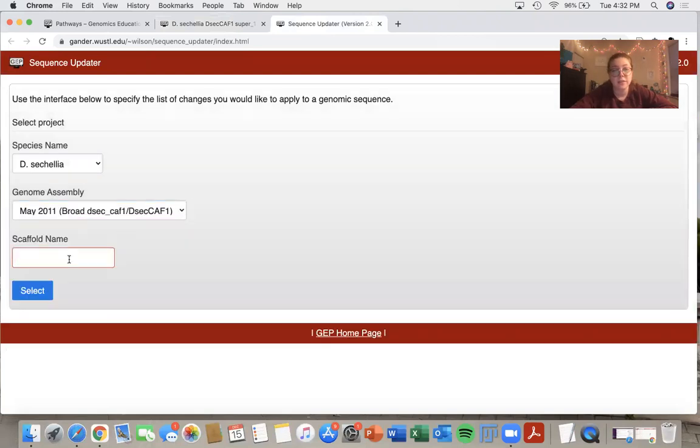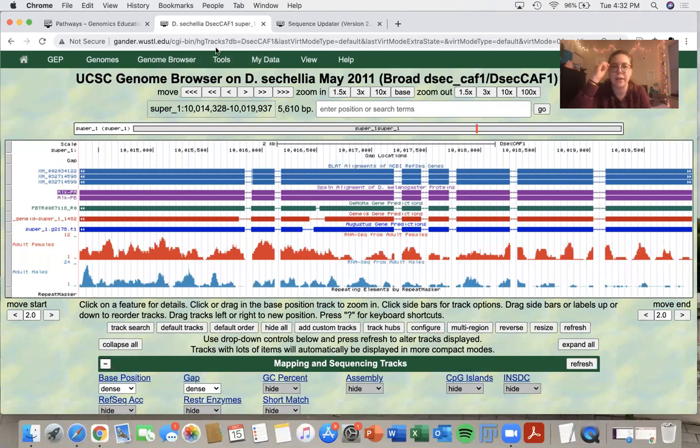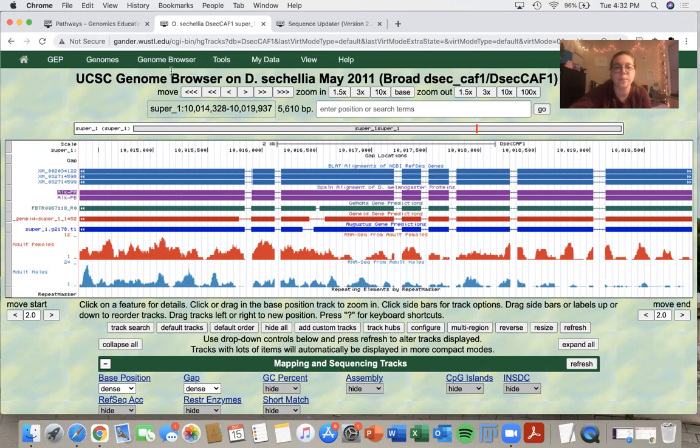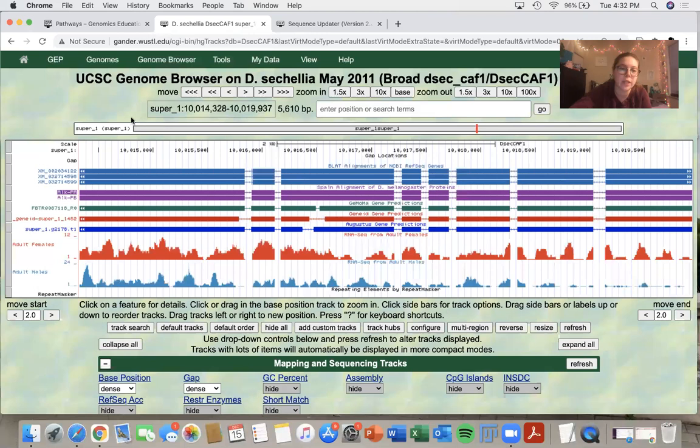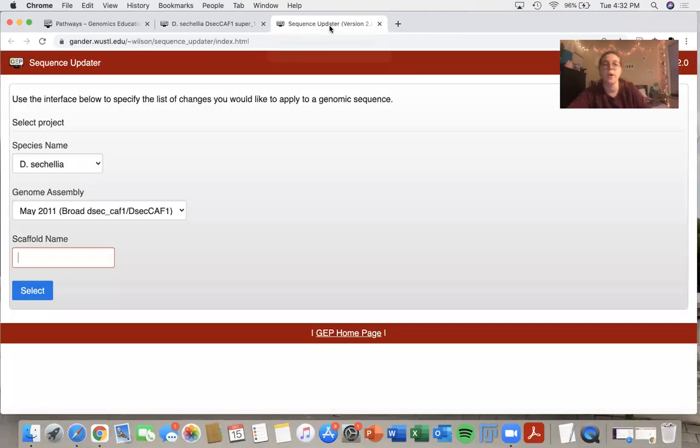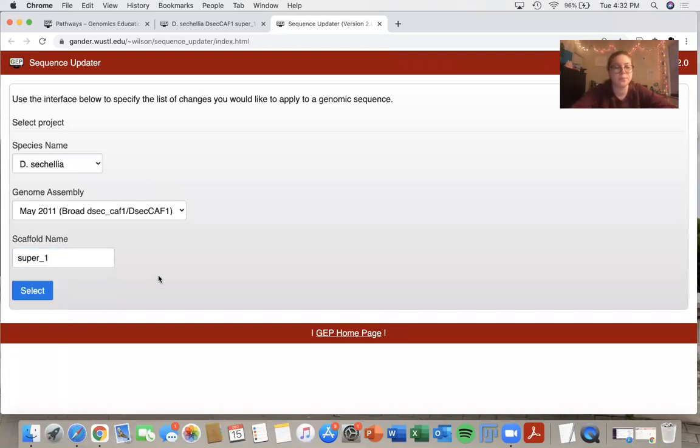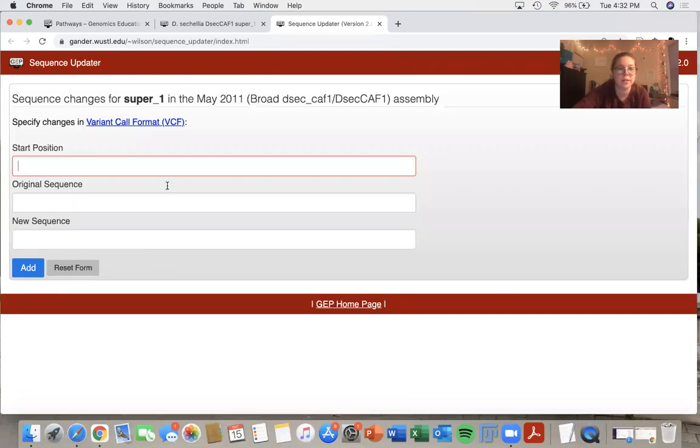To get the scaffold name, I will navigate back to the genome browser. There are several places where I can look for my scaffold name. One is up here with my coordinates. Another is right here. And the last place is underneath the scale bar. So I know that my scaffold is super_one. So I will write that in there. I will click select and it will bring me to the next page.